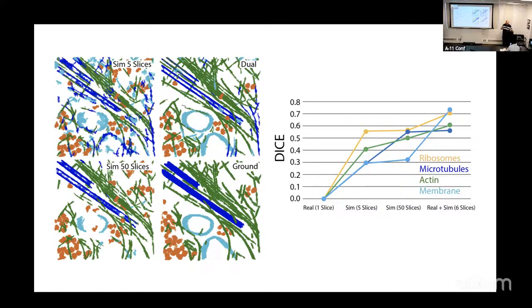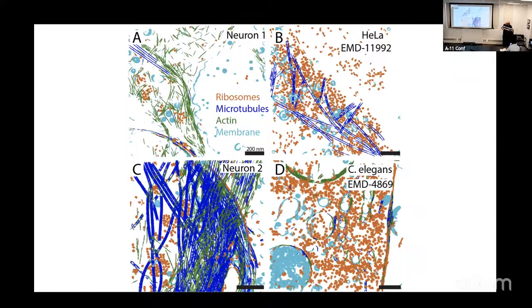But the nice thing is that if you have segmentations like this before you start out to train your networks, you're already in pretty good shape, because all you have to do is go in and hand correct some of the mistakes that the current network is making and feed that back into your training. And that's what we'll go over this afternoon.